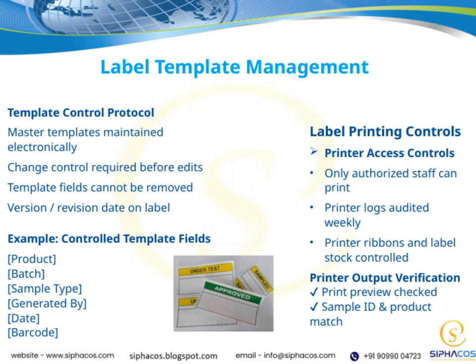Moving on to printer output verification. Before a label is finalized, we perform a print preview check to catch any errors early. We also verify that the sample ID matches the product to ensure accuracy and traceability.